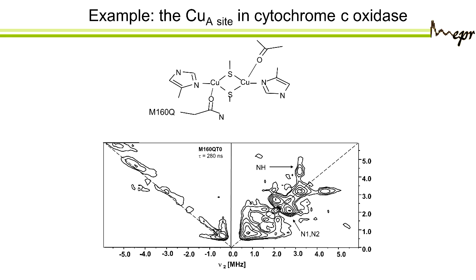nitrogen. So now if you look at the X-band spectrum, we don't see these nice lines where you see double quantum and the double quantum cross peak with the single quantum ones, but we see just double and double. So for instance here, these are the cross peaks, the red one, that come from this particular nitrogen.